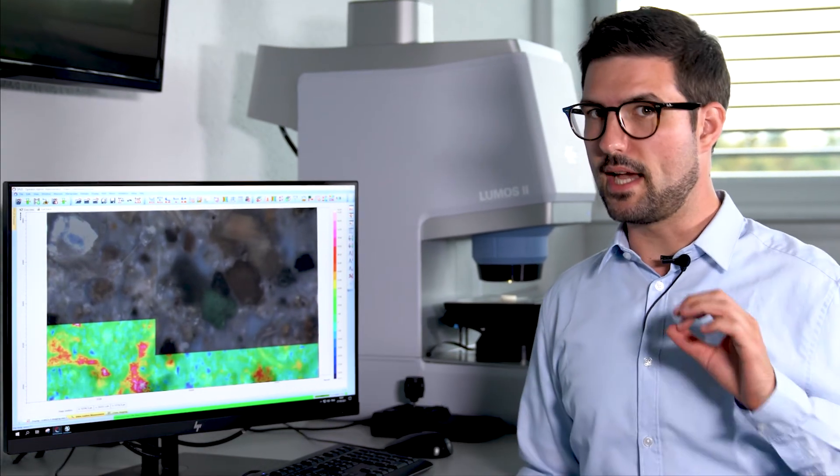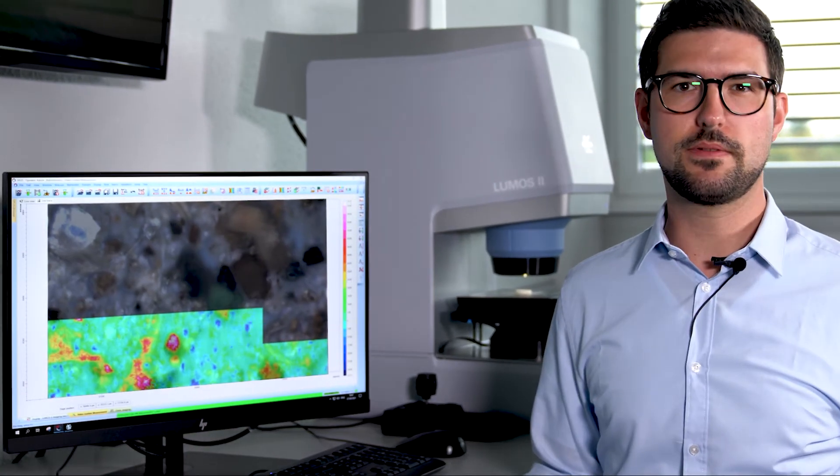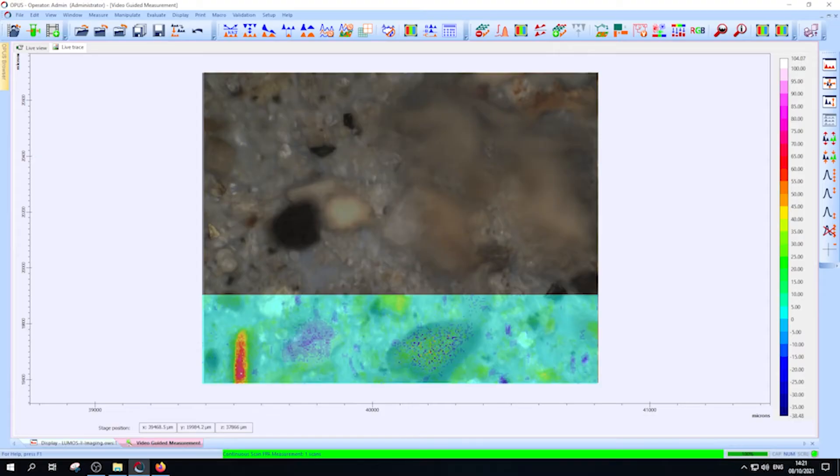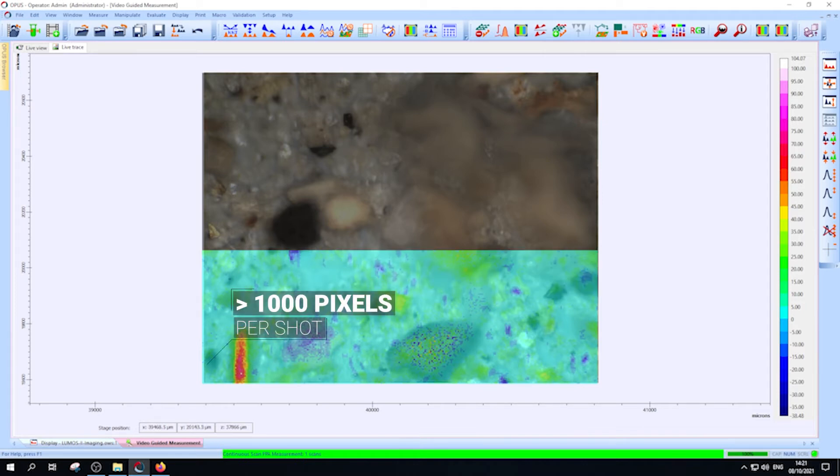What you see here is the unsurpassed imaging speed achieved by a focal plane array detector. It works like a digital camera, where each square simultaneously acquires over 1000 pixels at a spatial resolution of 5 micrometer.